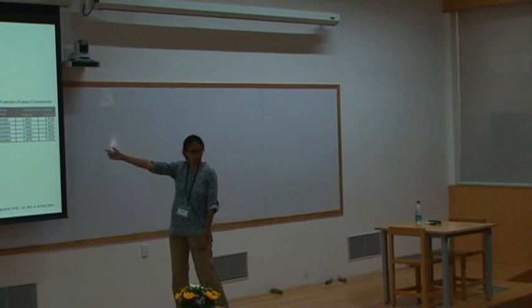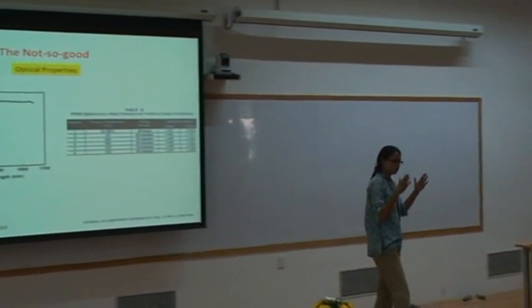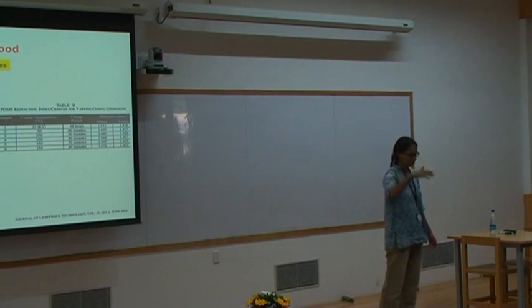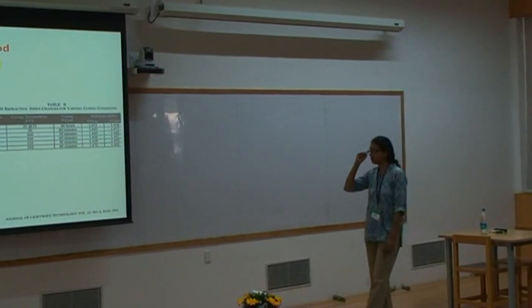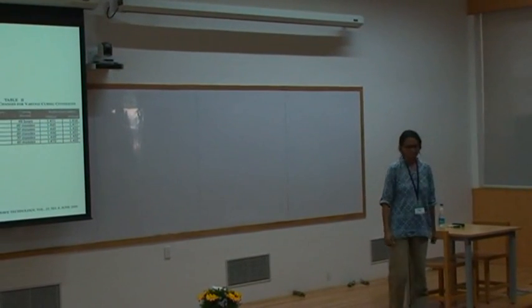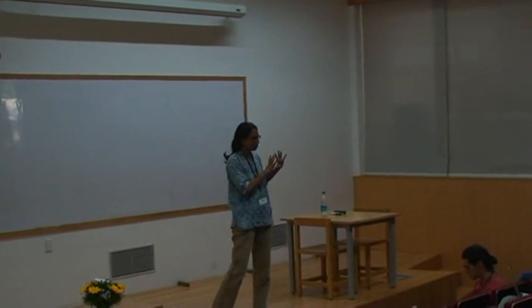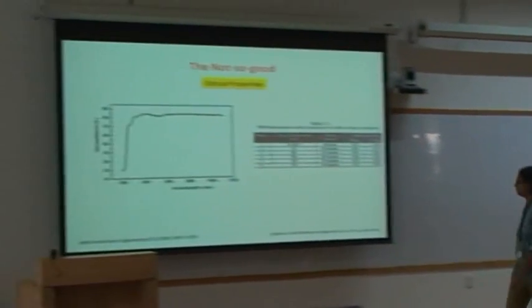But at least in refractive index of the material, you can see that it goes 0.02 in 1.45. Again, you lose light when you have a refractive index change, and this is just 60 minutes, and I keep it overnight, hoping that it will reach whatever it can reach. I didn't find the paper this morning on the laptop, but there are other measurements where people have gone to 1.48 with longer and more high density. Again, I think it's the chemistry, and the kind of polymers we use are patented. I would not be able to dig up why it is happening, but you don't know the chemistry at all.